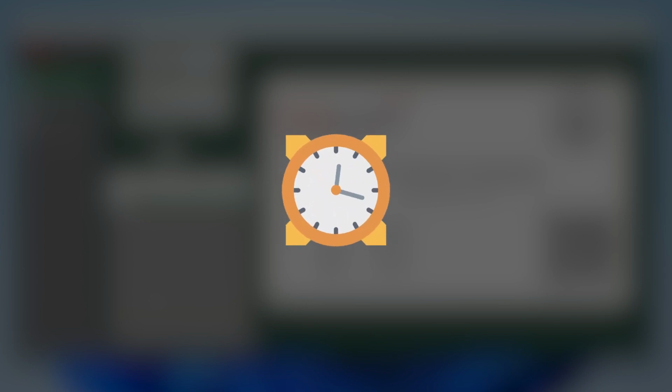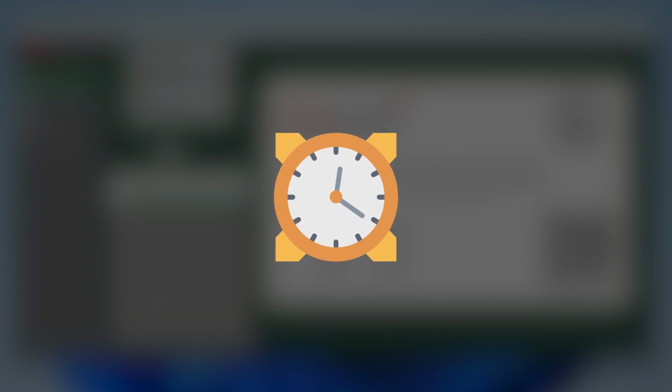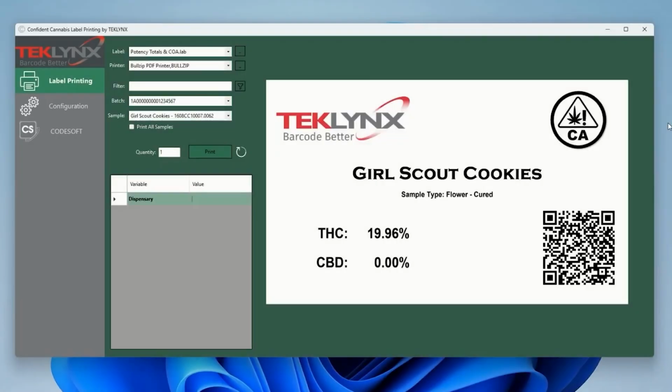A lot of times it's managed by downloading spreadsheets and attaching them to label templates, or manually entering or copying and pasting. And so our goal with this was to streamline that process and make it as simple as possible to label your products. So I'll give you a little lay of the land of what we're looking at here.